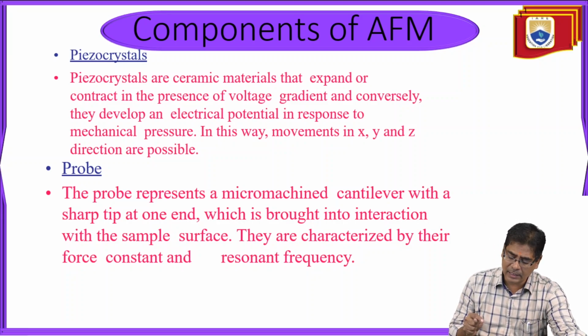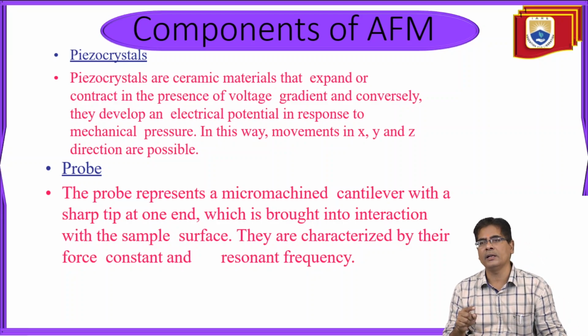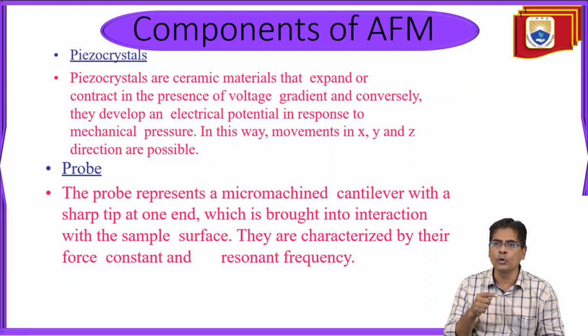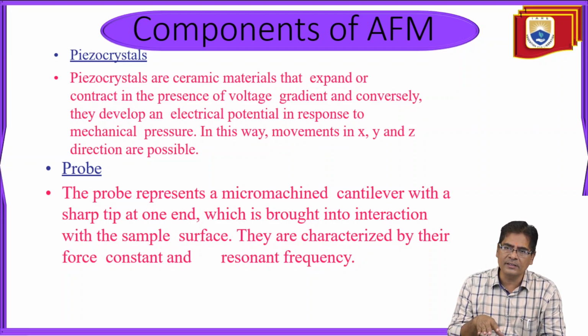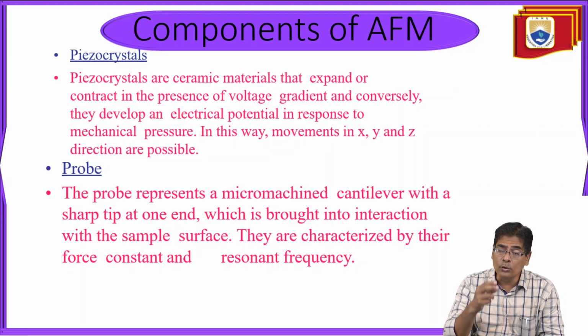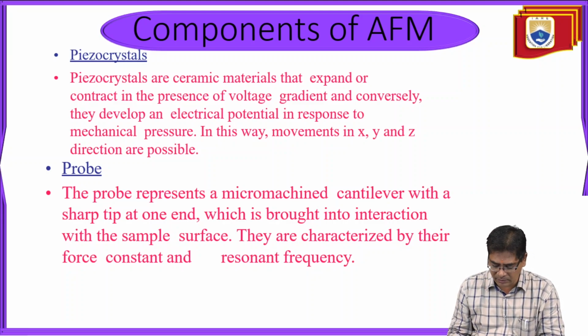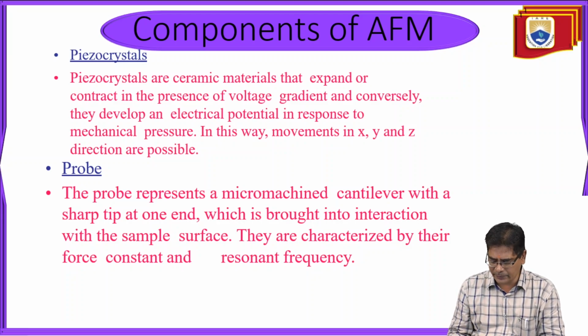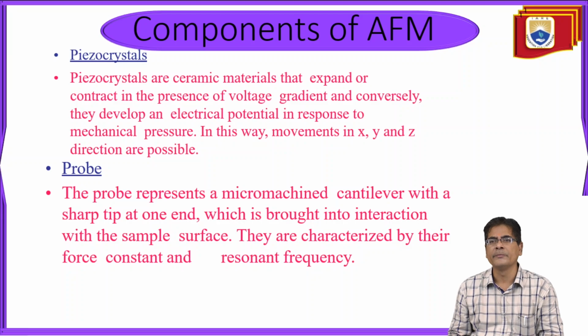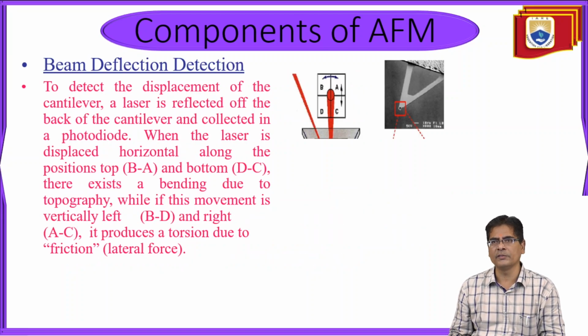When the cantilever interacts with the probe on the sample surface, there will be some vibrations, right? Due to these vibrations, they can calculate some parameters like frequency, amplitude, and time period. So these are some of the components of AFM.